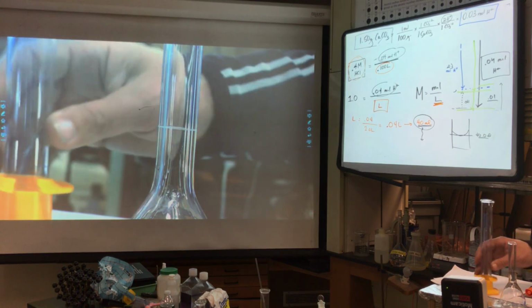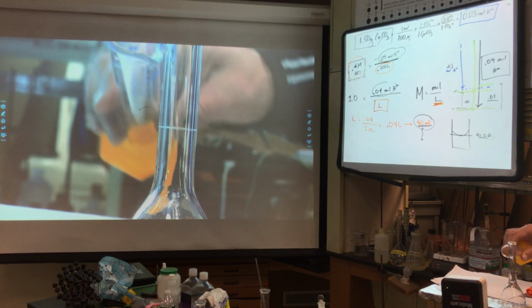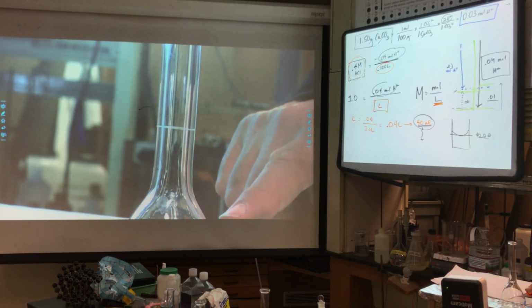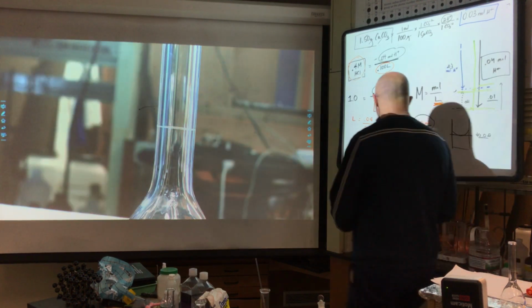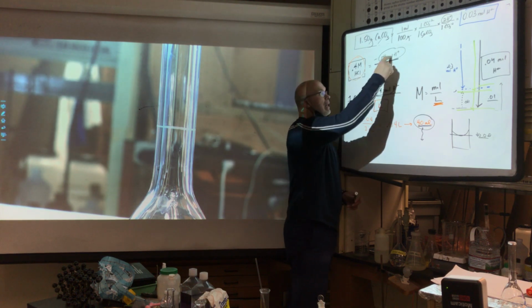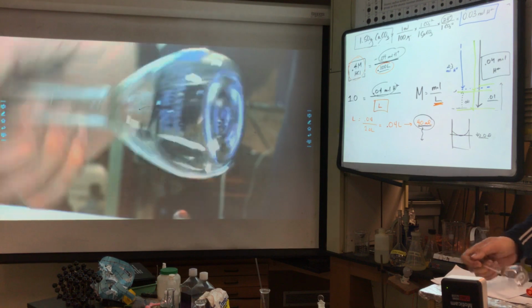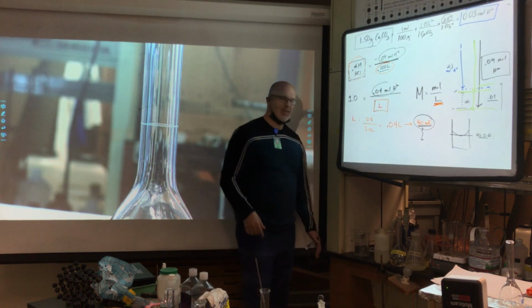The problem is, party people, I'm going to have some remnants in here. I can't get it all out, so I'd use some distilled water, wash it out, and add some more here. So I have 40 plus, because I washed it out to clean out the residue. In the volumetric flask, it's not at 100 yet. So what I do is dilute this to 100 milliliters. My 40 milliliters really represents 0.04 moles, and I dilute to the 100 milliliter mark. I fill this up with water, and boom, cap it, shake it up, and now I have a solution that's diluted.